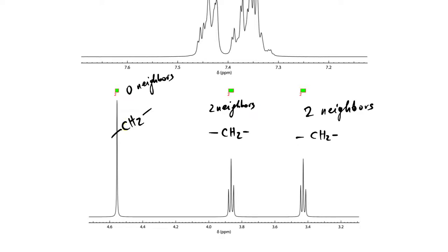Now, what's interesting here is this singlet at 4.6 ppm. Okay? So that means that within 2 and 3 bonds, there are no neighbors, which perfectly fits a substitution to the ring, and then substitution to something that doesn't have protons.